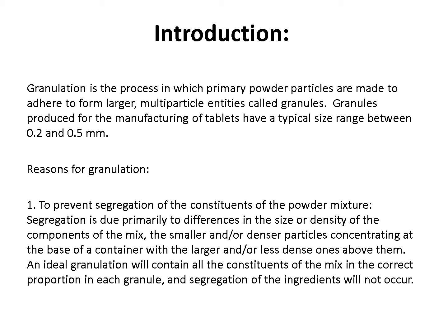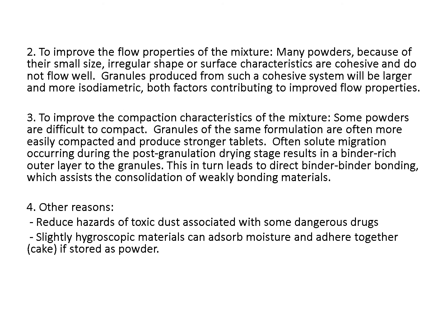So if we mix the large and small particles in the same proportion, we want the same concentration of the drug, and form one large granule. During manufacturing, vibration and agitation cause no segregation according to size, and the filling is the same, so the amount of the drug will be nearly the same, so it will enhance content uniformity. The second reason for granulation is to increase the flowability of granules.